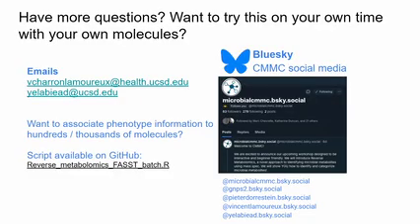The code that we did together today, you were using one molecule at a time. You used one molecule, collected the USI, retrieved all the similar or identical spectra from the fast search, then downloaded it and created this. And then you repeat that for the second molecule and the third molecule. But let's say you're interested in a full class of molecules. If you want to query hundreds or thousands of molecules, you cannot do that one by one. It's going to take you days.